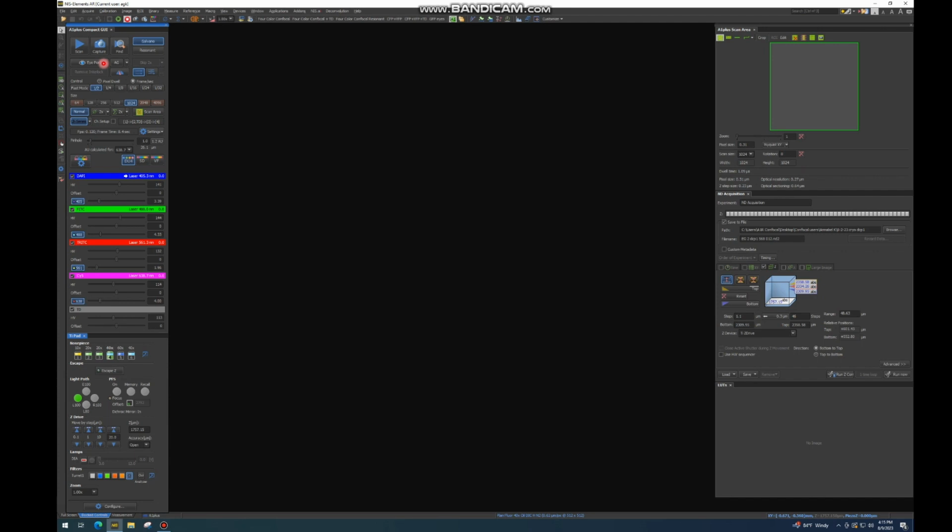Once you have your sample visualized through the eyepiece as you want it, you can put it onto scan. Scan takes a live feed image of your sample with the lasers. So the interlock will come on and you will no longer be able to look through the eyeport, and instead it will pull up the image with the lasers. While it's scanning, you can adjust the gain and the laser power to optimize the visualization and the settings of your sample for image acquisition.